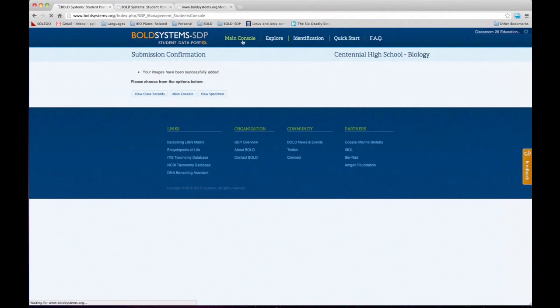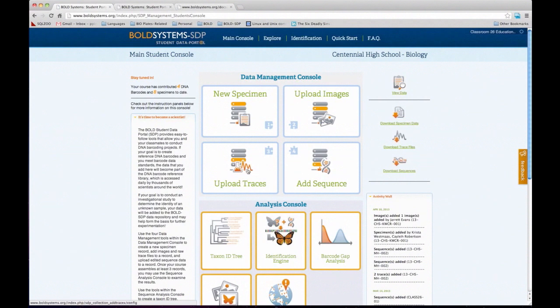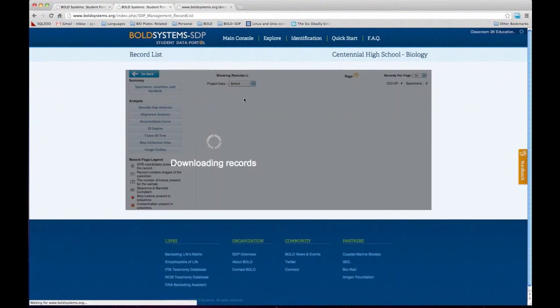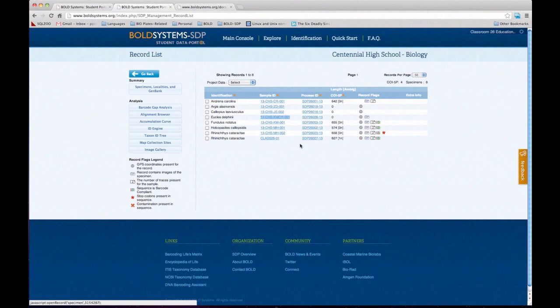Once we have the specimen page complete, we are ready to submit trace files. Here is where you'd be sequencing your specimen — you'd be getting trace files from CMB. You get the trace files that you have to submit to the record to create the sequence side of your specimen. DNA barcoding is basically made of two portions: the specimen information and the sequence information. We completed the specimen information; now we're going to start on the sequence information for that same specimen. The way we associate that information is through the sample ID.